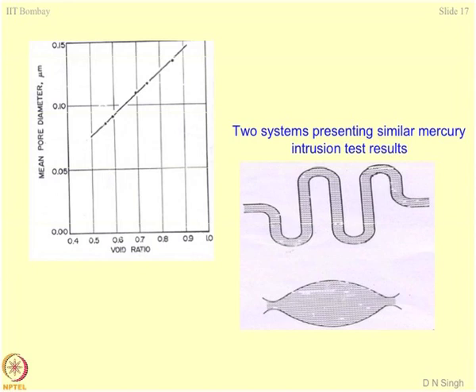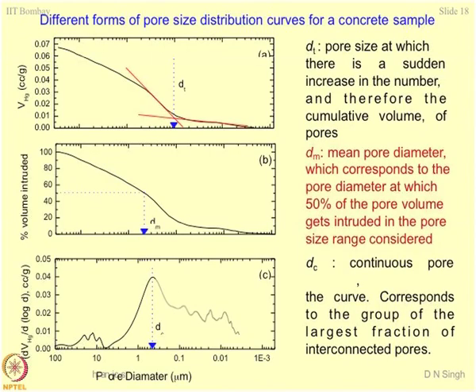How much energy is required to melt it? For that, pore structure is required to be studied. And a lot of resins, polymers, and catalysts which are being fabricated by the industries require this type of study, and they contact us for doing this test for them. Some more interpretation on the results which you get from mercury intrusion porosimetry.